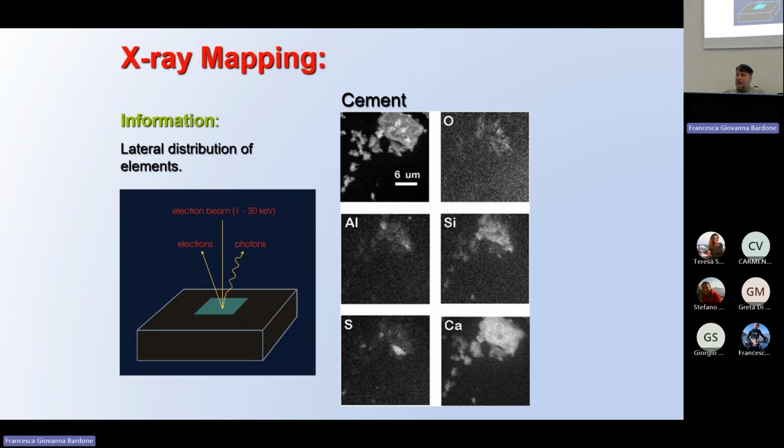So I extract this sample and I calibrate using standards for oxygen, aluminium, silicon, sulfur, and calcium, using standards with known concentration, and I compare the signal coming from the standard with the signal acquired. Then you get real quantitative data, the amount in terms of weight or mass.